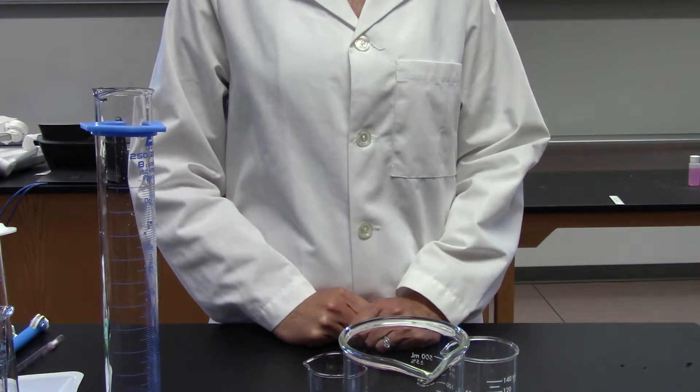In this part of the lab, you are learning how to accurately measure using the metric system.